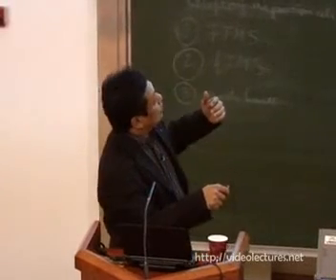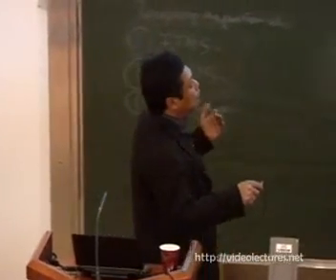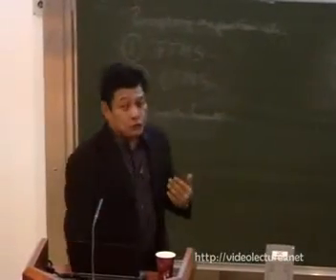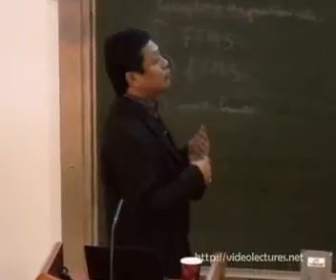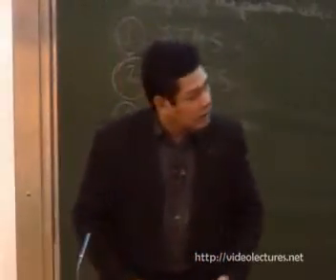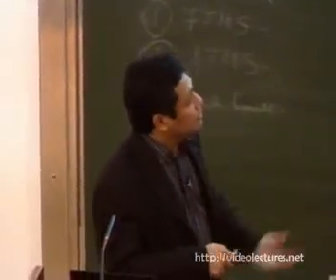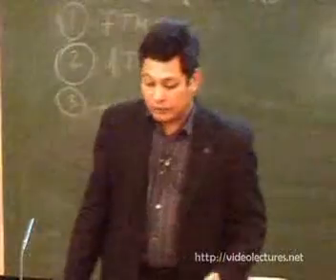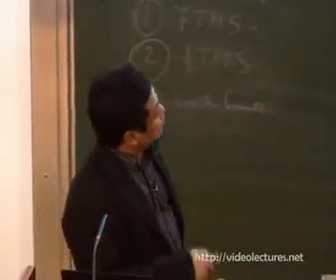So this molecule is also important because it plays a central role in photosynthesis. That's the origin of life on Earth, because the plant leaves produce the oxygen that we breathe. And so it comes up that it would be nice to use single atom manipulation techniques to study single molecules of chlorophyll. The idea started because we wanted to study the origin of life at the atomic or molecular level. So let's start doing that. One of my students was interested in it, so we started.